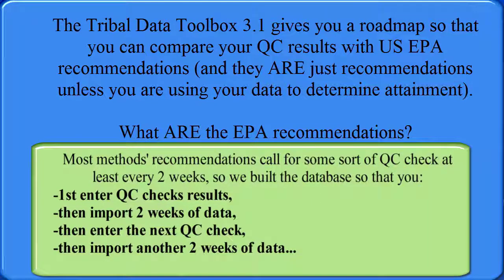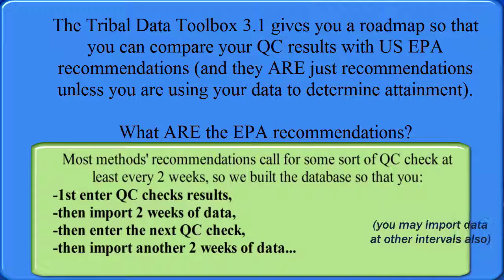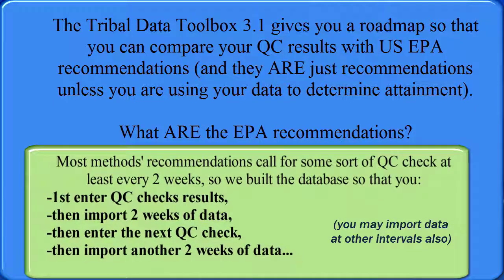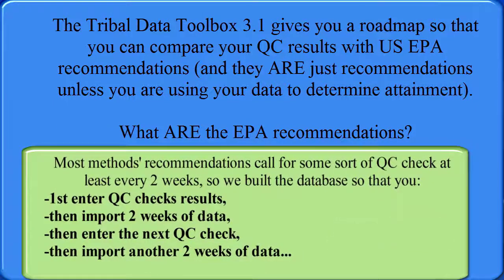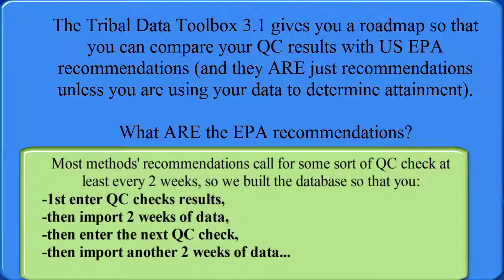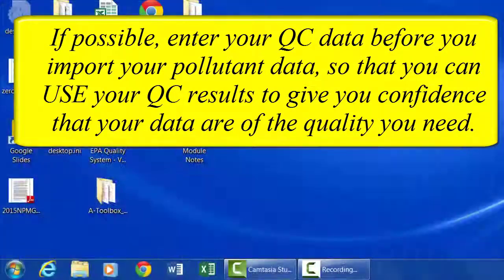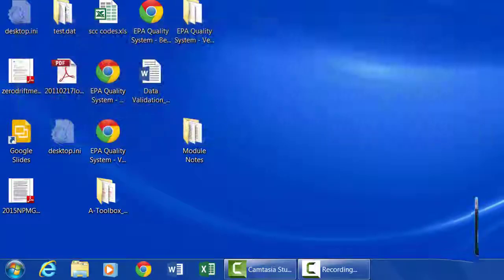If you cannot do it this way, like if you just do not have time to enter your QC data into the toolbox before you import your data, it's okay to import your data first, your concentration data that is. However, that's not the recommended sequence of steps, and we highly recommend that you enter your QC data before you import your pollutant concentration data.